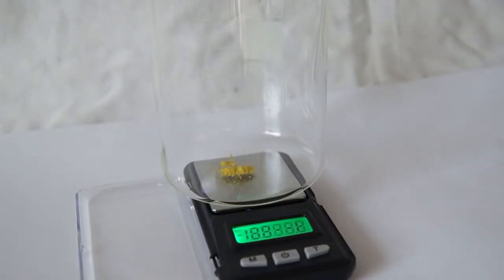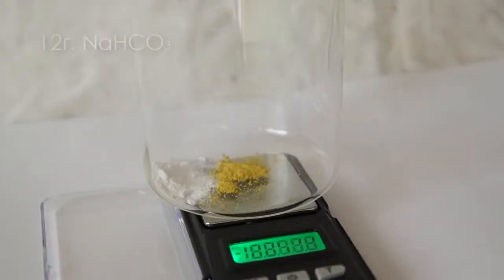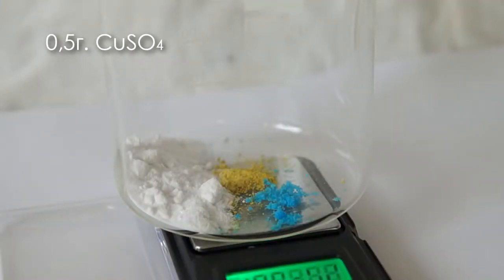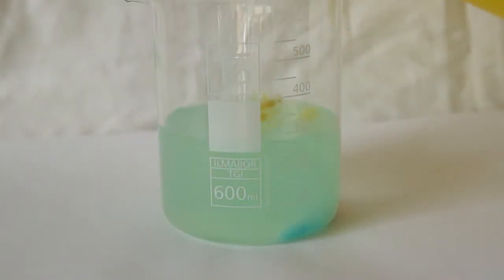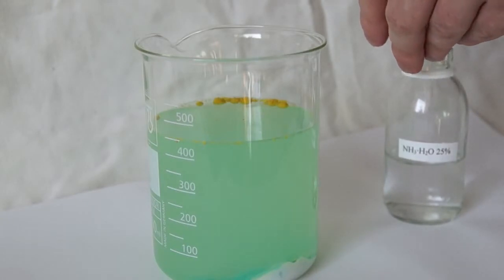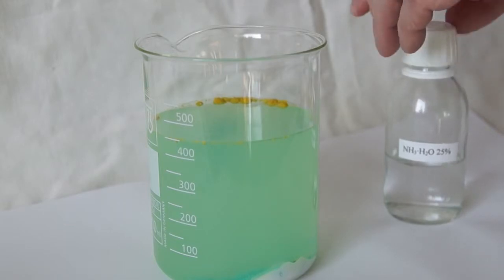So to begin, let's prepare a solution of luminol. For that, let's weigh about 0.2 grams of luminol in a large glass, furthermore adding 20 grams of baking soda and half a gram of copper sulfate. Next, pour half a liter of water into our mixture. Then add a small amount of ammonia solution and a few drops of sodium hydroxide solution.